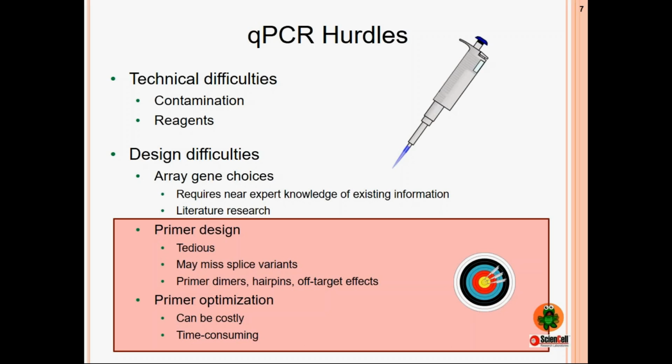For example, quantifying gene expression of a gene that is inefficiently or variably amplified would be of little use, right? Especially if you're trying to compare its relative expression to a gene that is efficiently amplified. What's more, each failed or suboptimal primer pair represents reagents, potentially precious sample, and time gone. These issues are less easy to resolve, but I'll go over what we do at Sciencell to prevent, detect, and rectify these problems and ensure that our qPCR primers are fully optimized.